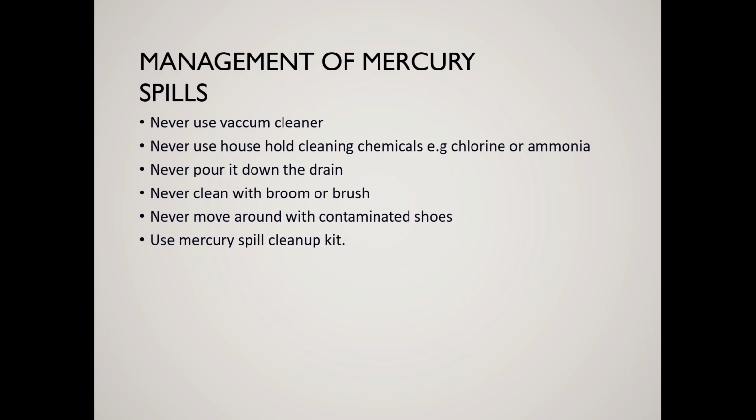Okay, now coming towards the management of mercury spills. Never use a vacuum cleaner if the mercury spills. Never use household cleaning chemicals, chlorine or ammonia; it's going to cause a reaction. Never pour it down the drain. Never clean with a broom or brush. Never move around with contaminated shoes.